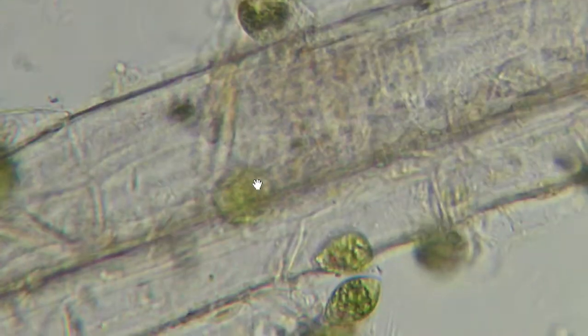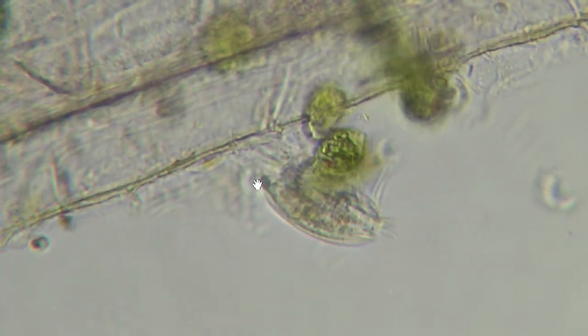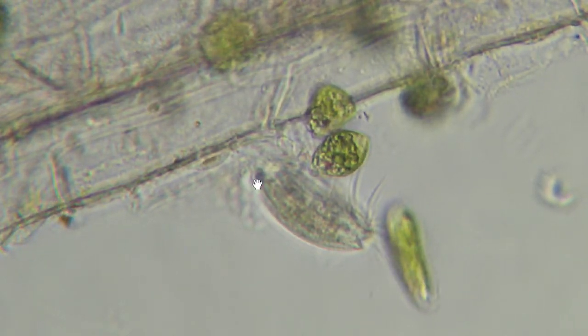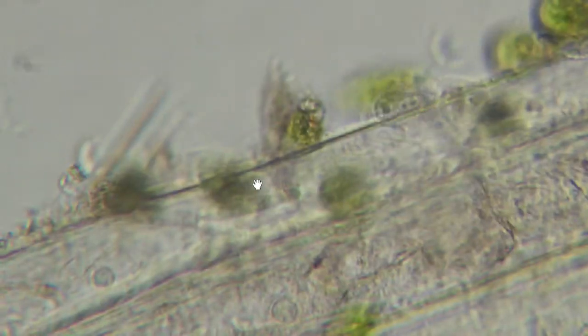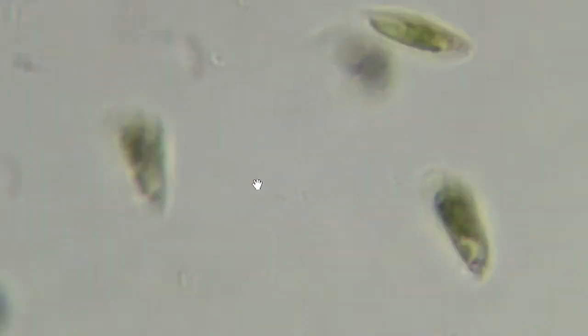Zoom out a bit on my digital because it's a little too close. There we go. Where's that flexible one again? Oh, there's Euplotes again. Hey, go walking again. Euglena action. So Euplotes is taking a break. There's the flexible one again. Let's see what you're going to do. There you go. See that flat flip up in the front? It's very squishy.